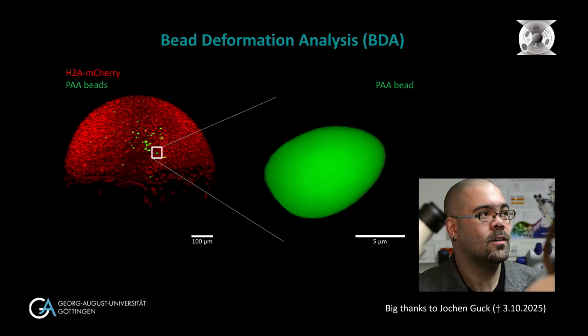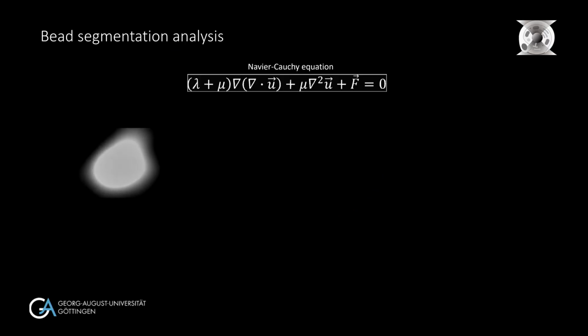So now you have such a shape. What do you do with this, right? And there are several things you can do with it. This is the underlying equation that you have to solve. The u here is the displacement. These are basically the mechanical properties that are involved. And what we care about here are the surface forces. And this looks like an innocent little equation, but it's quite complicated because you have all these second derivatives.